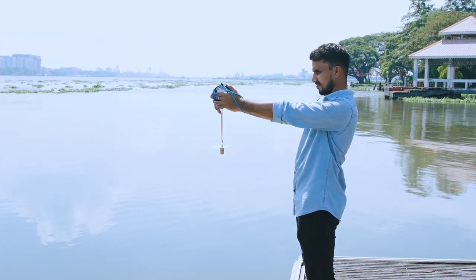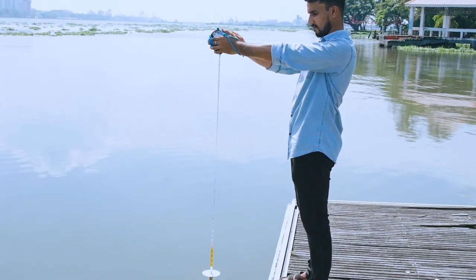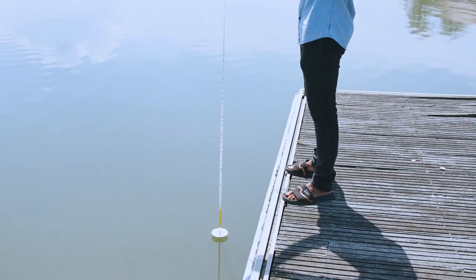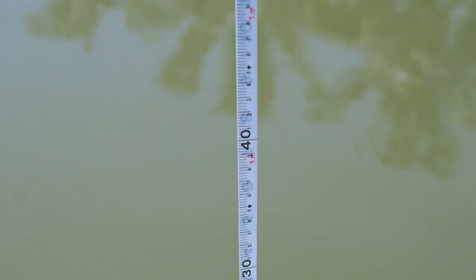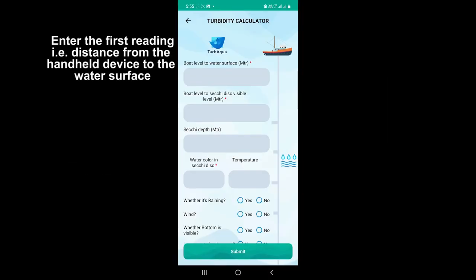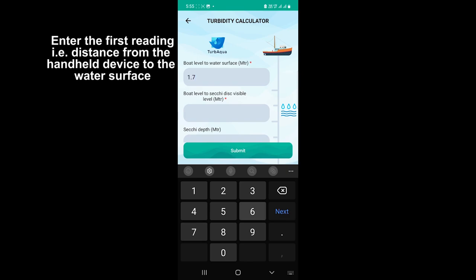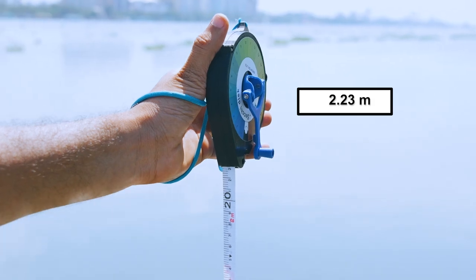Now let's proceed to the Secchi measurements. The white disc is lowered into the water and the distance from the handheld device to the water surface is measured — that is DO. Next, the total distance from the device to the depth at which the disc disappears and just reappears is measured — that is TD.